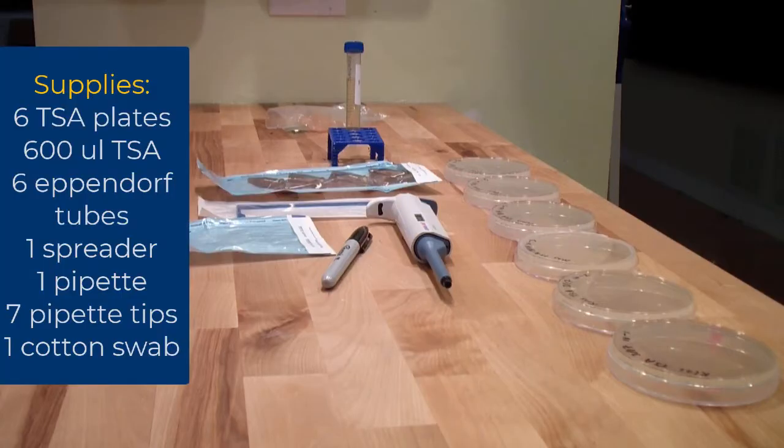Gather your supplies. You will need six TSA plates, 600 microliters of TSA, six Eppendorf tubes, one spreader, one pipetter, seven tips, and one cotton swab.